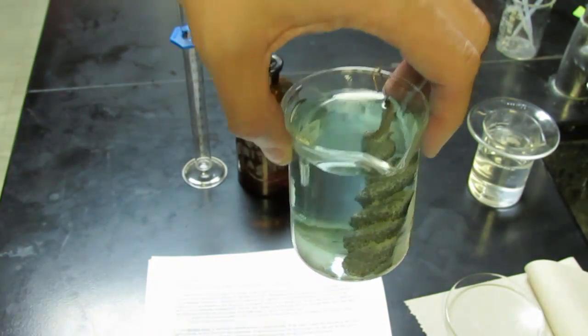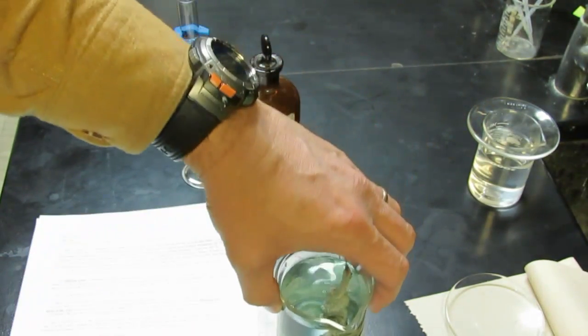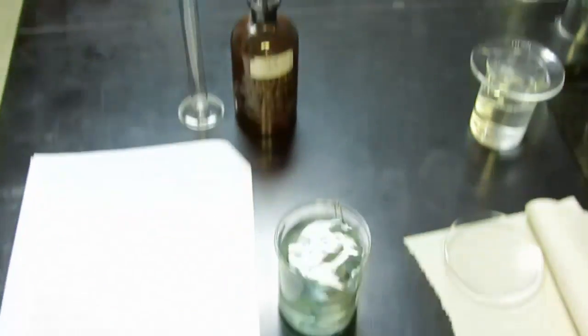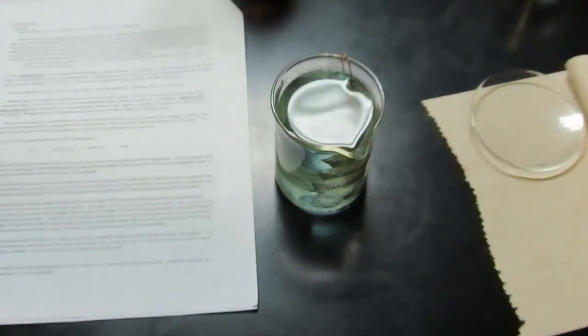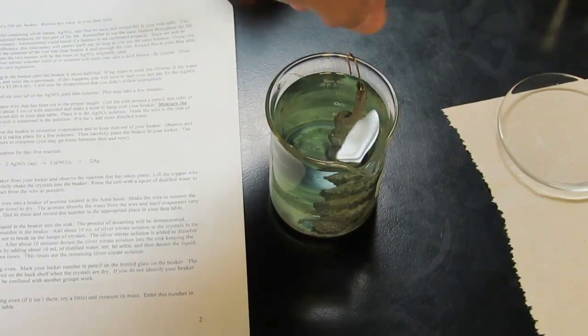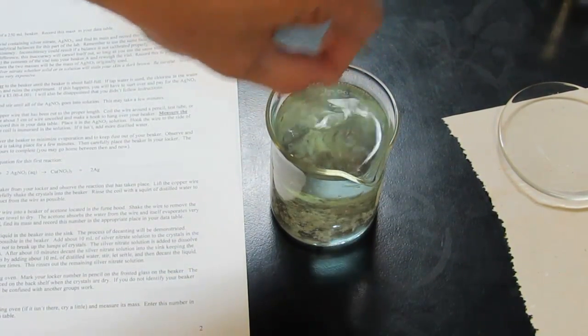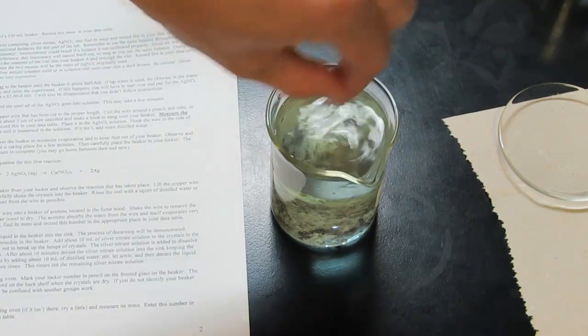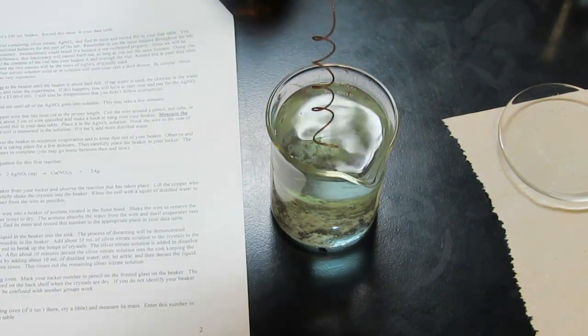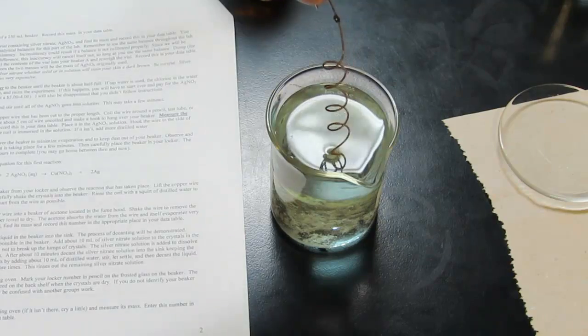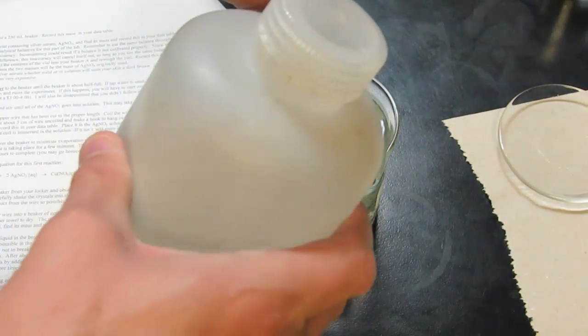Now what we're going to do is shake that silver off of our copper wire as well as we can. So we'll pick up our copper wire and give it a good shake. We'll get as much of that off as we can. That copper wire is bare. We're going to rinse this copper wire off with a squirt of distilled water.